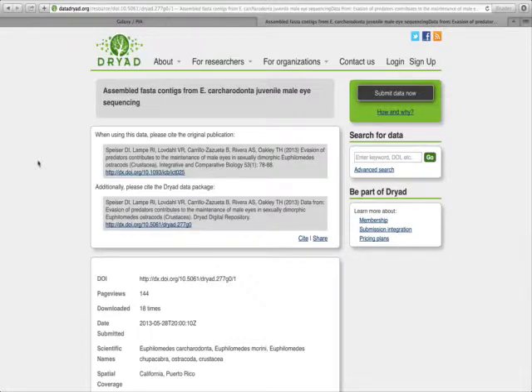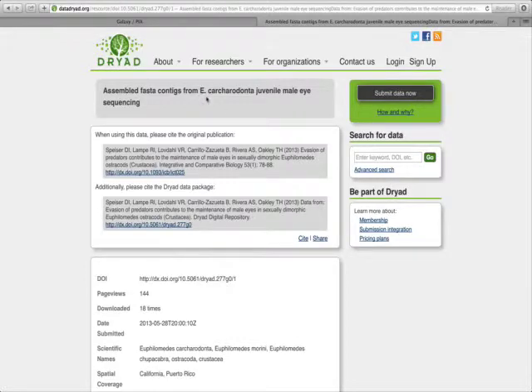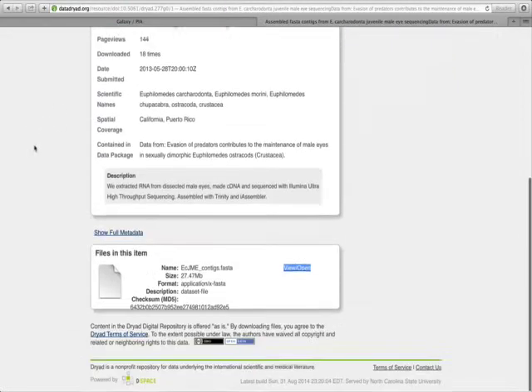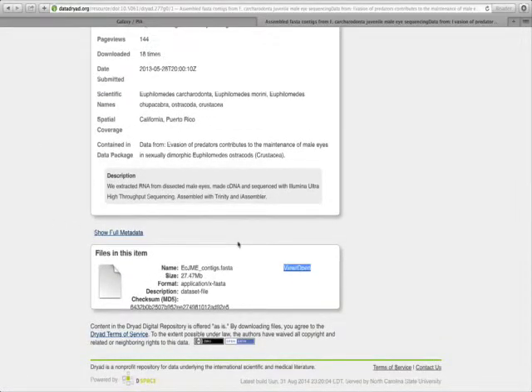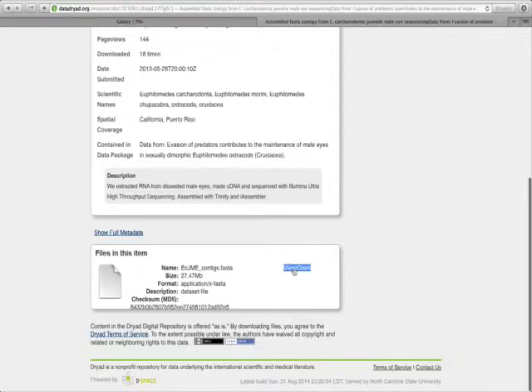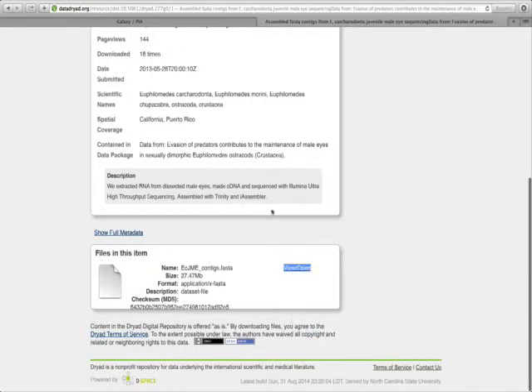This dataset on the Dryad Repository is a transcriptome from the Ostracod Crustacean Euphilomedes carcharodonta. Down at the bottom is a link to the dataset in FASTA format. I'll right-click here where it says View Open, and I will click Copy Link.